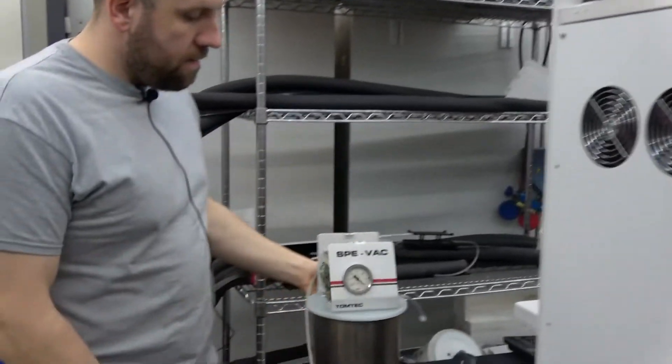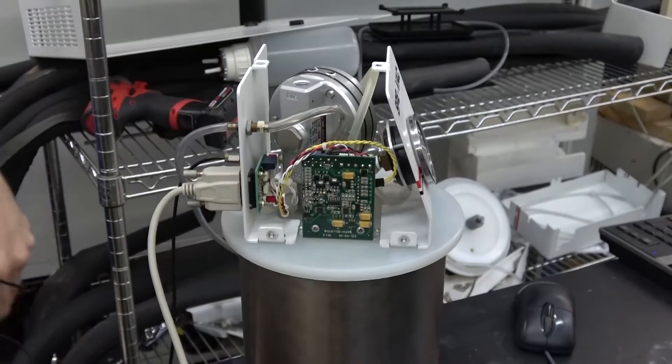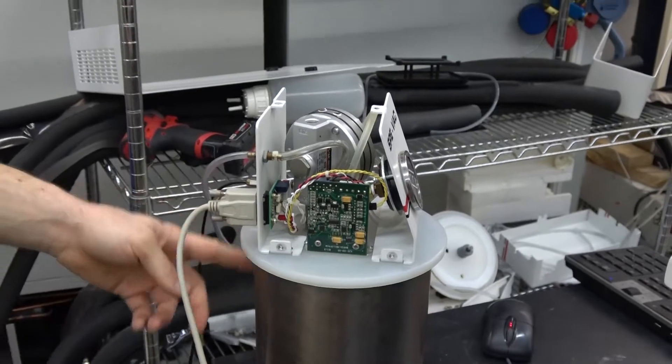Here is the back trap that's used for solid phase extraction, with the hood off so you can see inside. It's got a couple valves and a float switch.